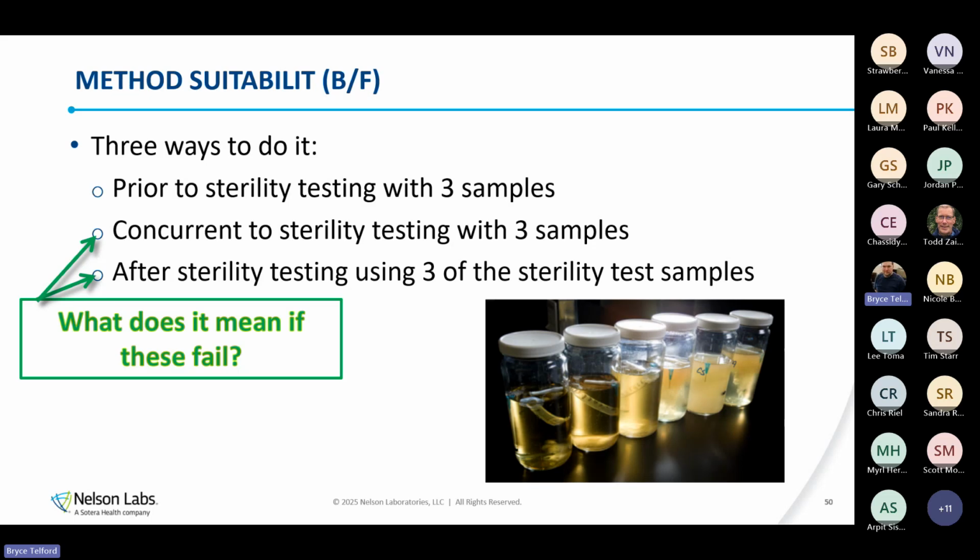So if we have a product that we suspect or we know is inhibitory, we're going to want to do that testing prior to the test of sterility so we can ensure we're properly neutralizing the product, so that we can ensure that we have passing results before we move on to the expense and time of sterility testing.